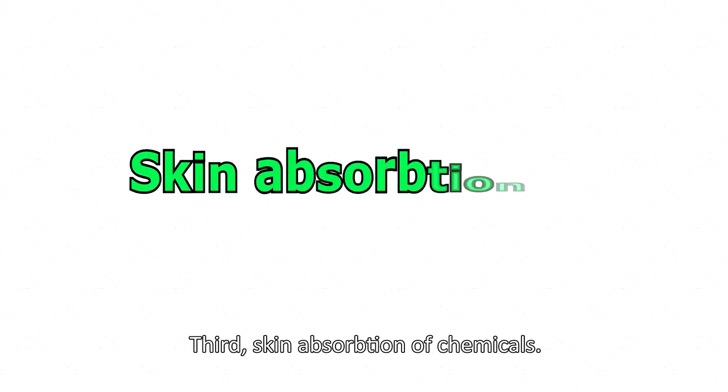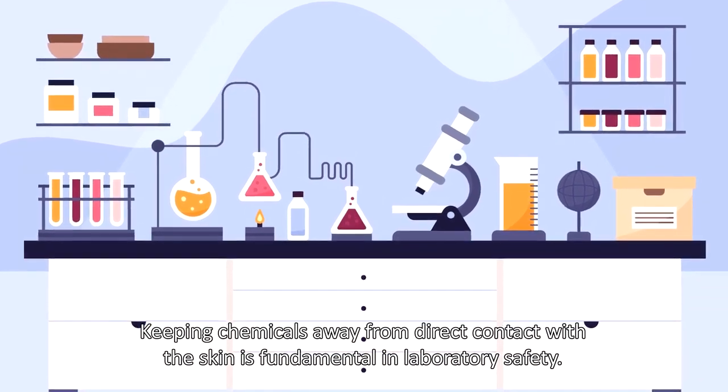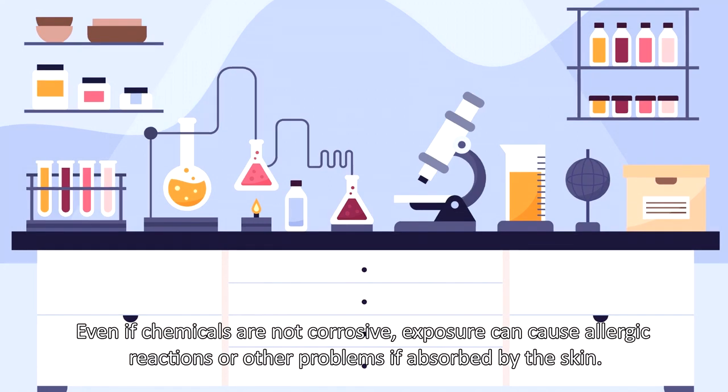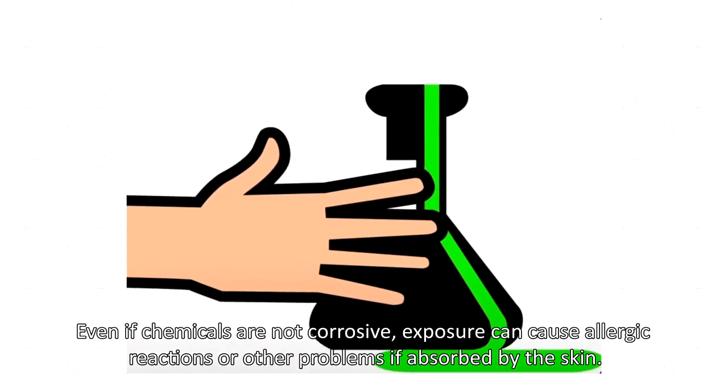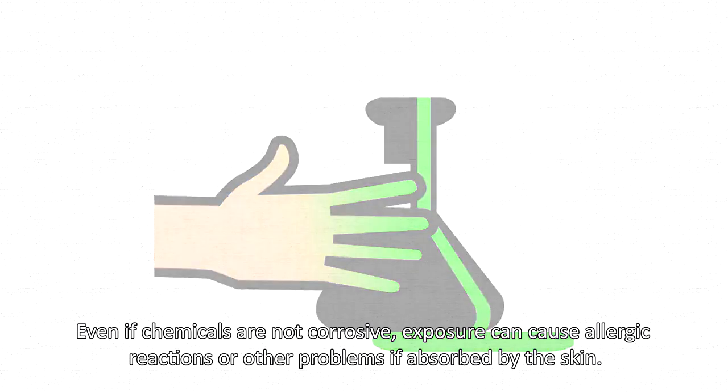Third, skin absorption of chemicals. Keeping chemicals away from direct contact with the skin is fundamental in laboratory safety. Even if chemicals are not corrosive, exposure can cause allergic reactions or other problems if absorbed by the skin.